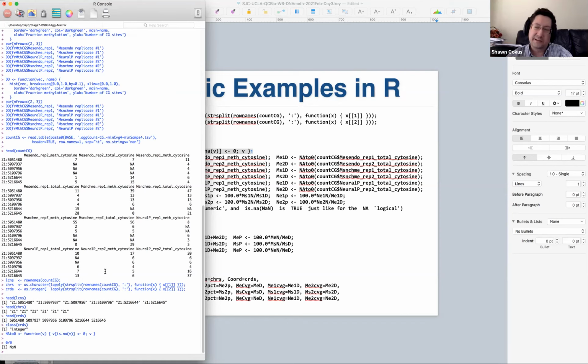And actually, we're going to use percents rather than fractions, because fractions display not so well. Percent makes more sense for humans. And so, yeah, let's turn those NAs to 0. So this little NA to 0 function, if you have a little list, let's say 3, 5, 7, 9, NA, 9, 4, 2, 5, NaN.